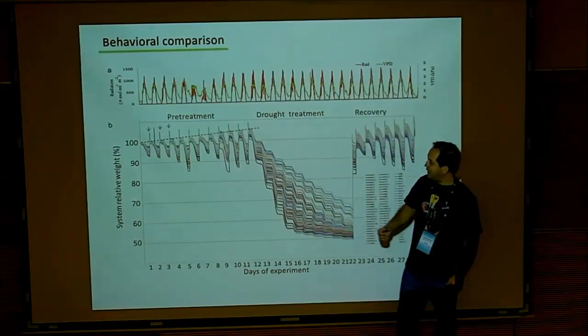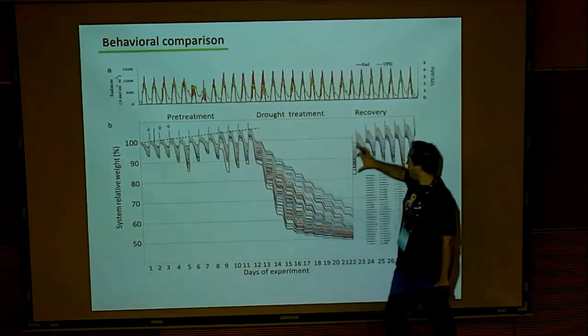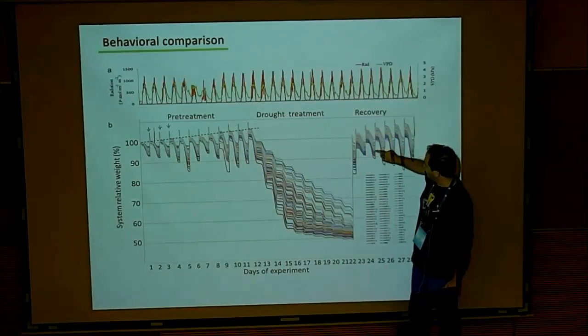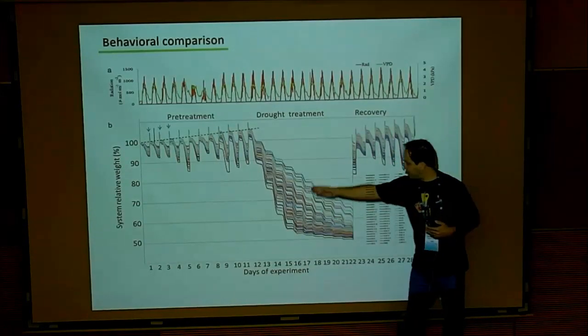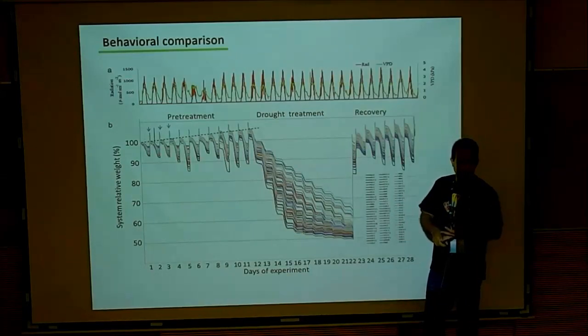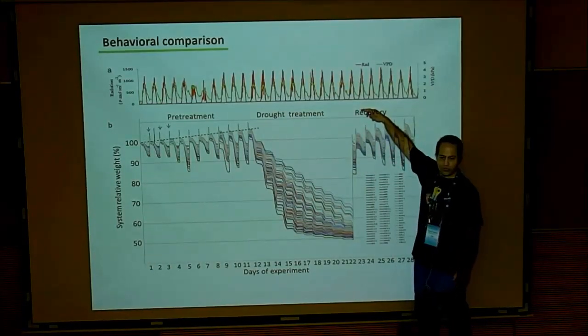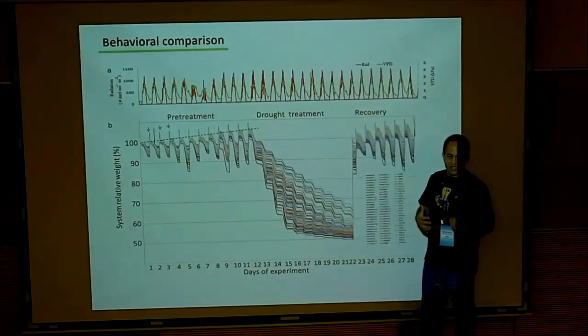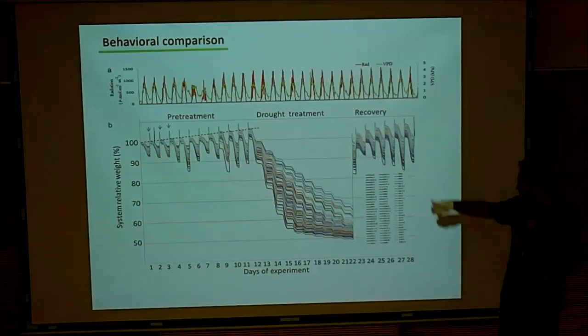What we call resilience is comparing the performance of a plant before the stress and immediately after. Of course, you expect some decline in transpiration because the plant loses roots and leaves during stress. And we also always have a control, so you can also compare the plant to its well-irrigated control. So what we call resilience is the rate of recovery: how fast you recover when rain comes.